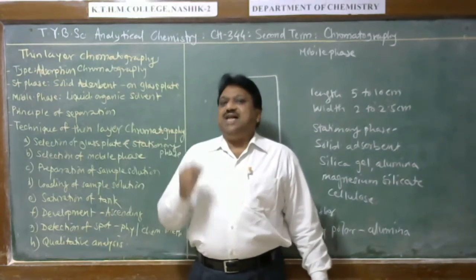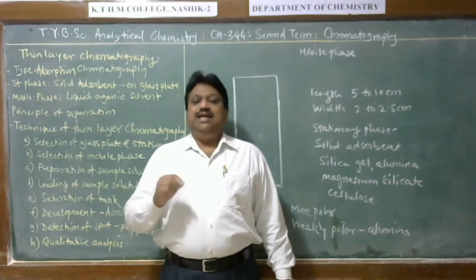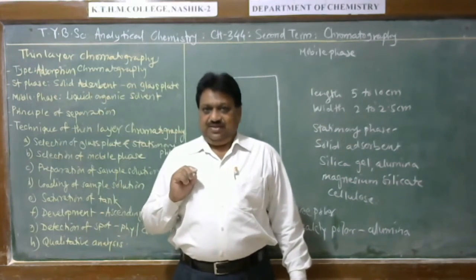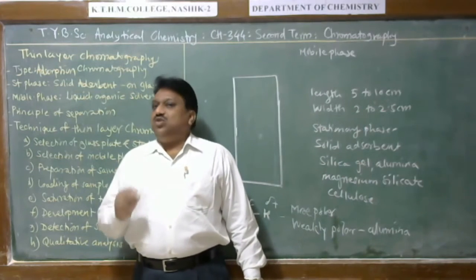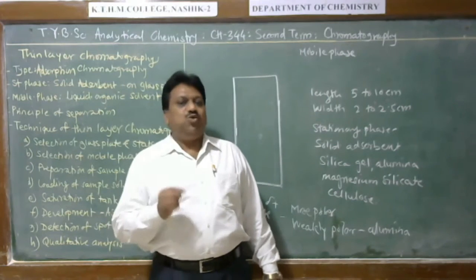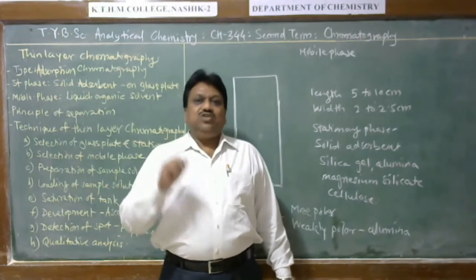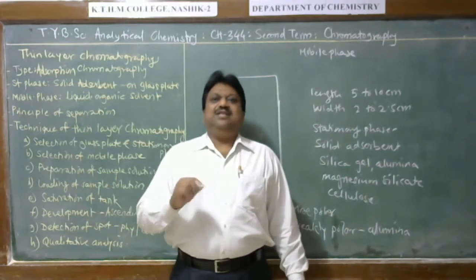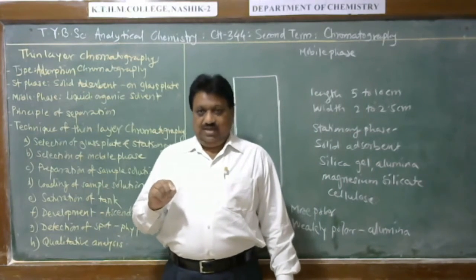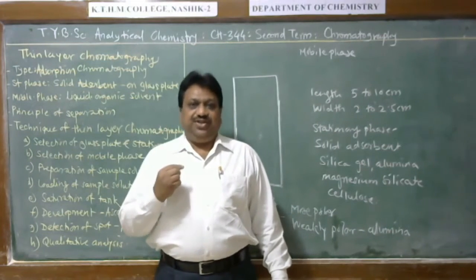Here the condition is that the sample component must be soluble in the developing solvent; then and only then will those be carried by the mobile phase through the stationary phase. Otherwise, if the sample is insoluble in the developing solvent, then the mobile phase is unable to transport them through the stationary phase and separation is not possible. Therefore, in chromatography, the mobile phase must have the ability to dissolve all the sample components, and only then are those components carried through the stationary phase.